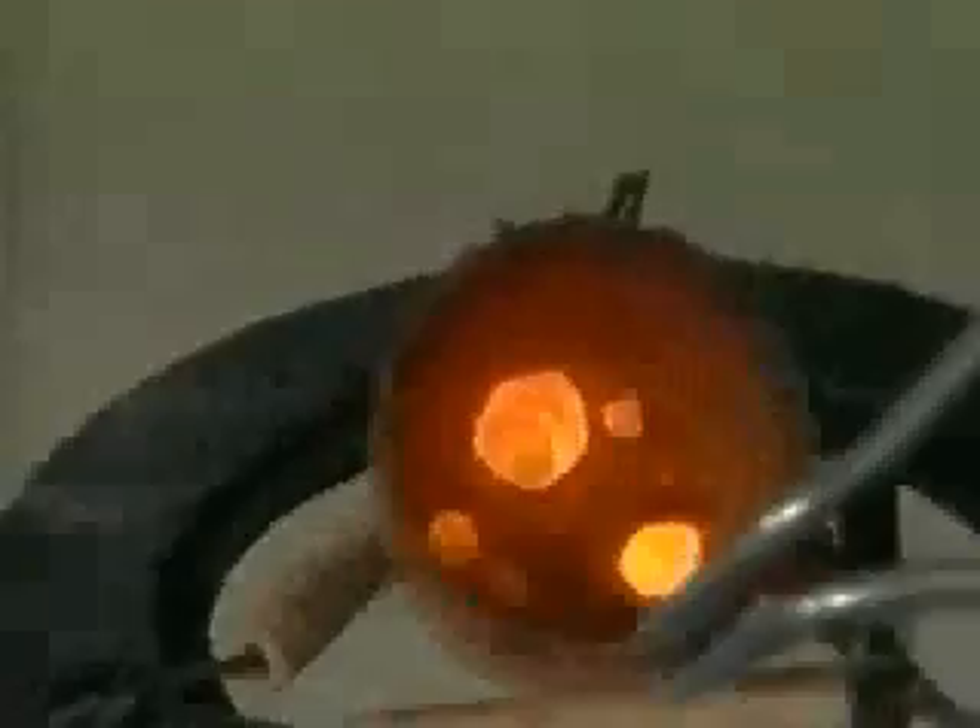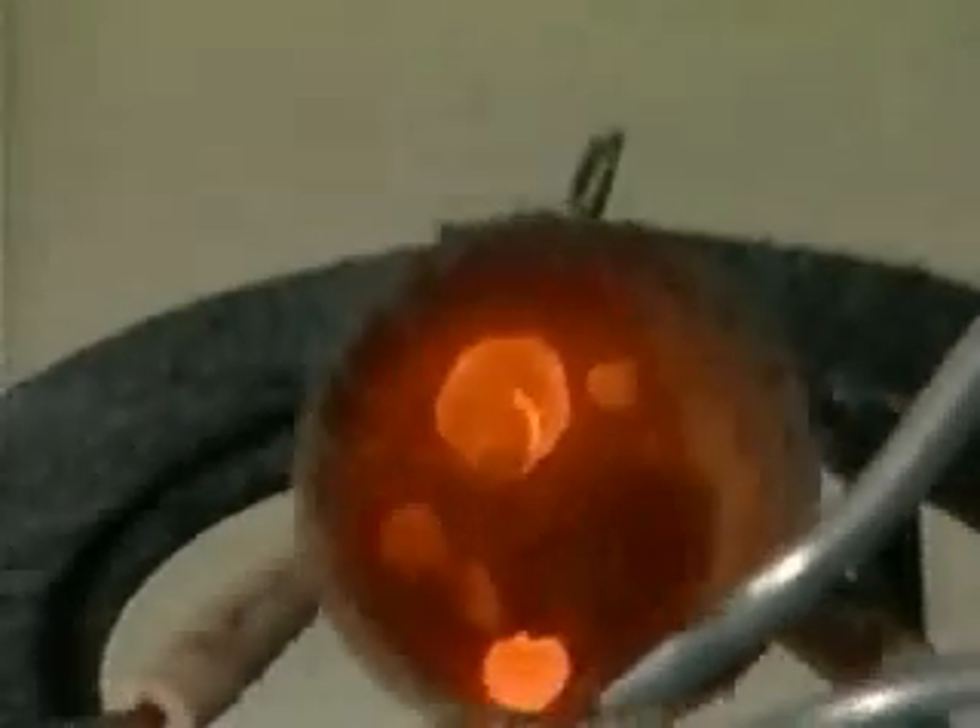The aluminum has reduced the iron oxide to iron. When we look into the crucible, we see a ball of white hot iron glowing at the bottom.